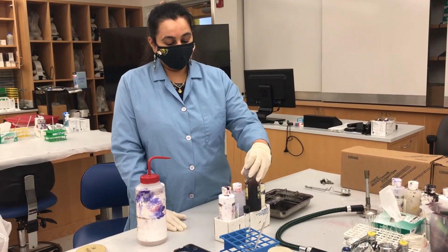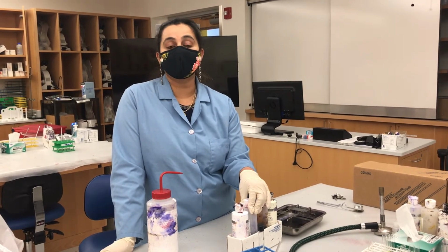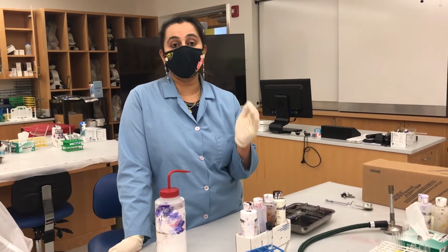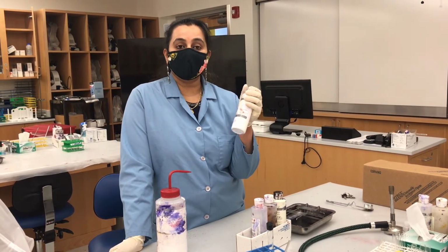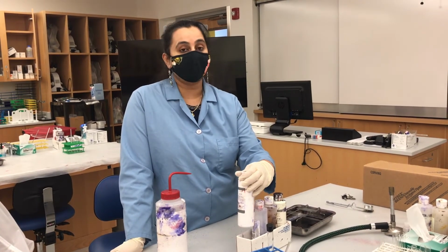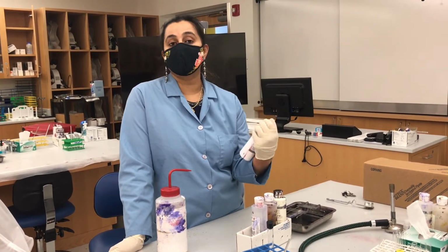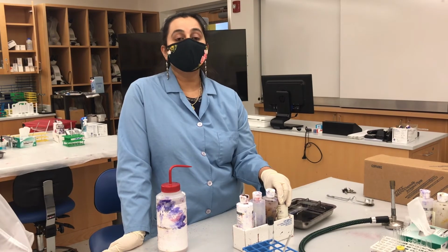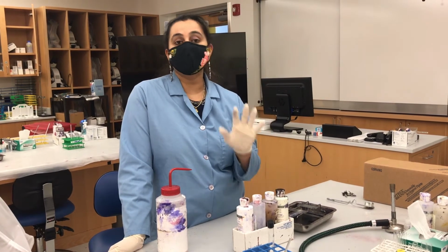The third reagent is the decolorizer, so that the primary stain is washed off from gram-negative cells but not from the gram-positive cells, because gram-positives have thicker cell walls, so they retain the stain. That's only if you add the decolorizer for a very brief 8 seconds. Okay? And then you add your secondary stain, the counterstain, safranin, and at that point only your gram-negatives are able to take the pink stain, because gram-positives already have the darker crystal violet purple stain. So at the end of your gram staining procedure, gram-positive cells should look purple and gram-negative cells should look pink. But always remember, there are exceptions.